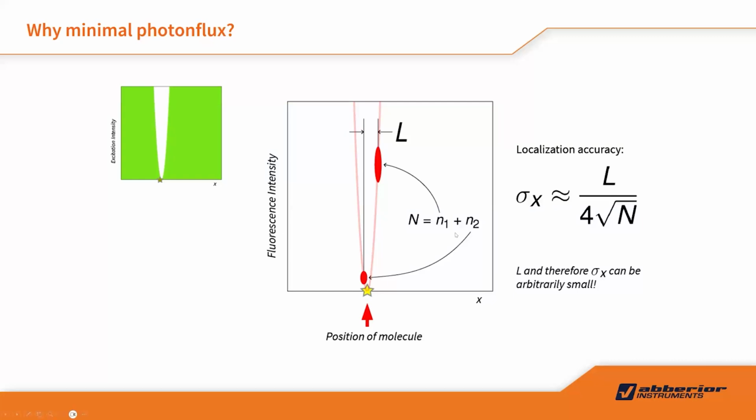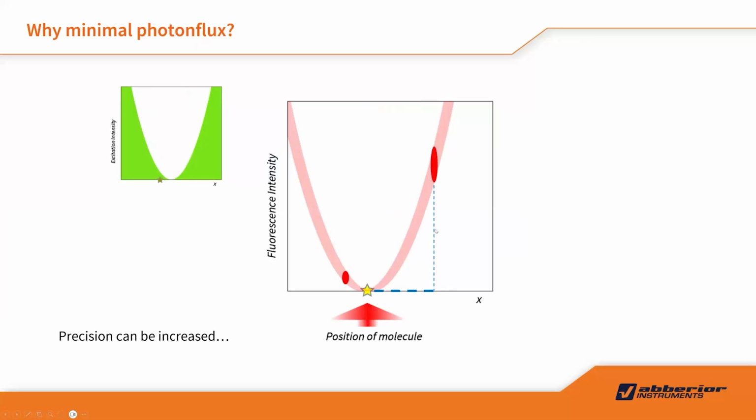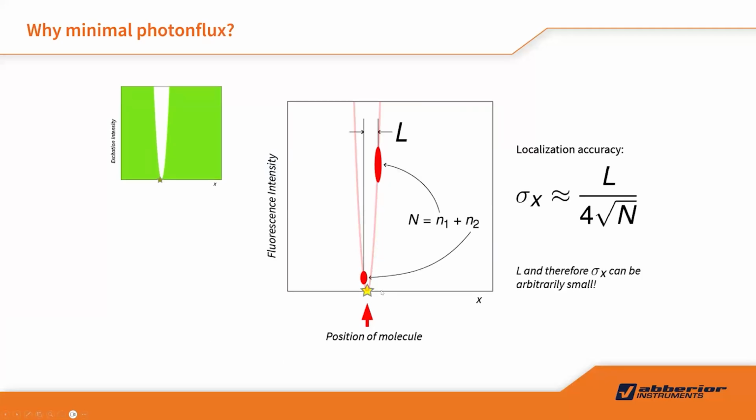Okay, right? It's easily explained in this slide, right? If we try to reduce the error with the same signal background, the sensitivity of the position change in the x-axis is more sensitive.